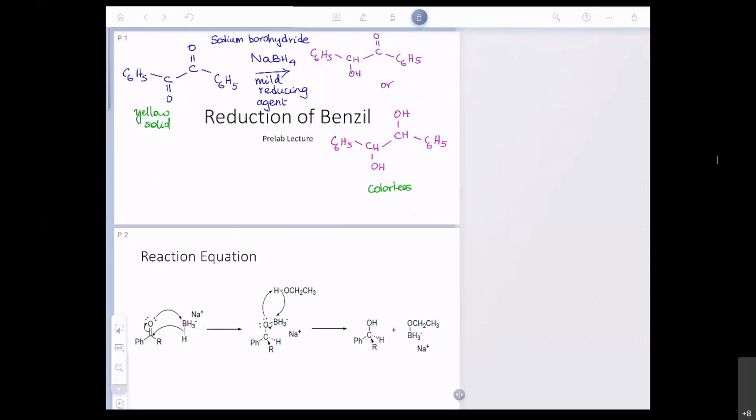Whereas sodium borohydride is a lot more forgiving, and you can actually use it in some large excess, and also use a protic solvent such as ethanol. Some of it will get destroyed by the protons in the ethanol and still doesn't catch fire because it's not so reactive. It reacts with the carbonyl group to convert it into an alcohol.